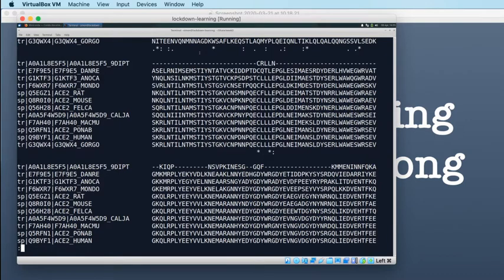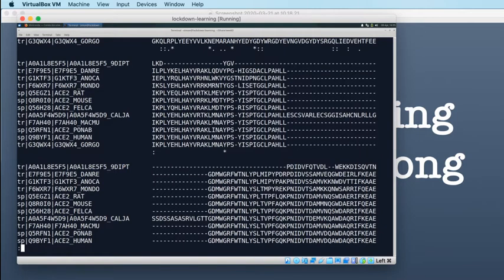But between now and then, I am going to check that top sequence and see if I've got it right, if it actually is just a distant ace relative, or if it's really not an ace and it's throwing off our multiple sequence alignment more than perhaps it should. See, there are little regions where it's similar, like this pair of leucines here, slightly similar, but it's not really very convincing as an alignment. So I'll have a check. I'll look into it and I'll see.